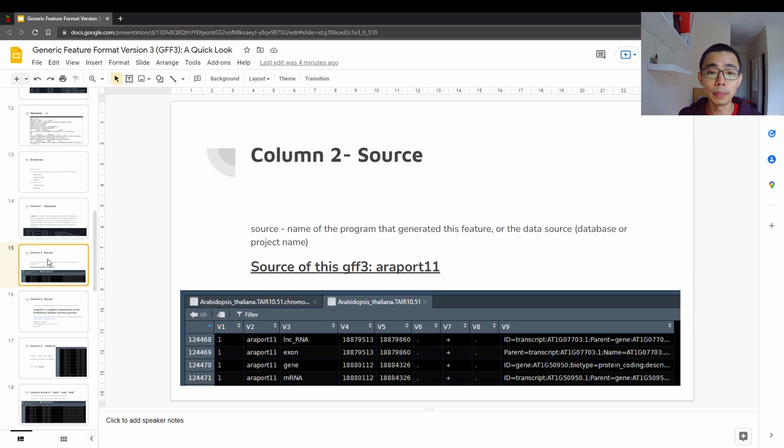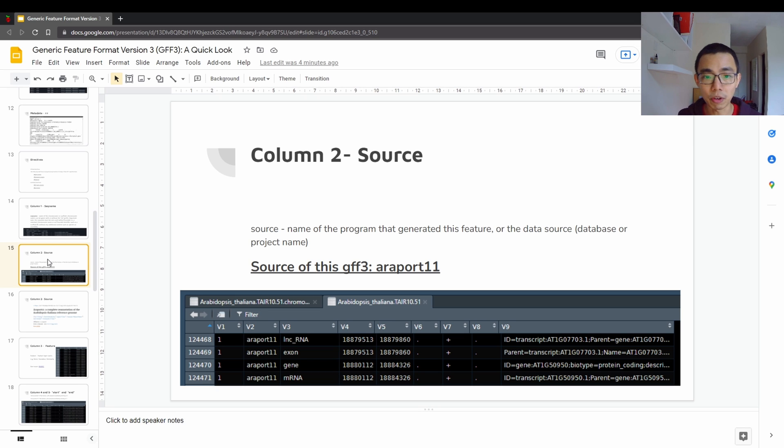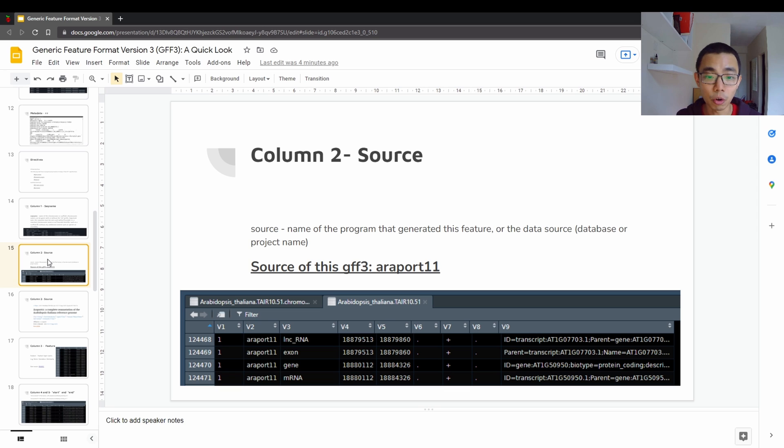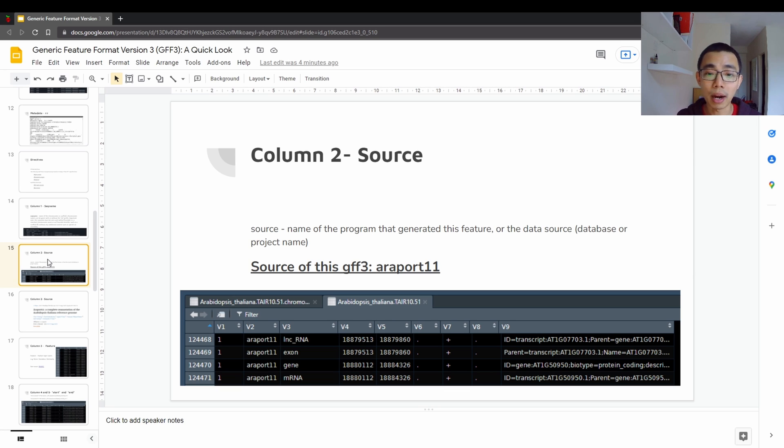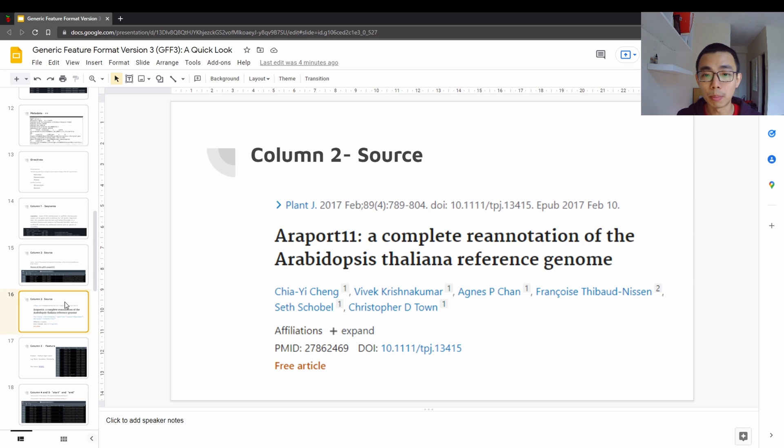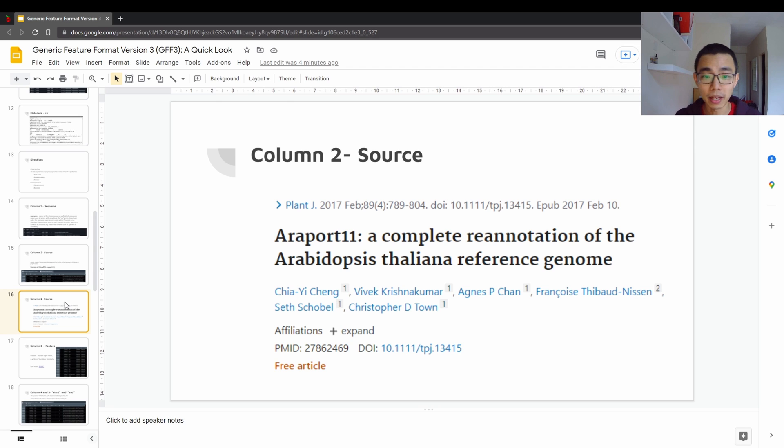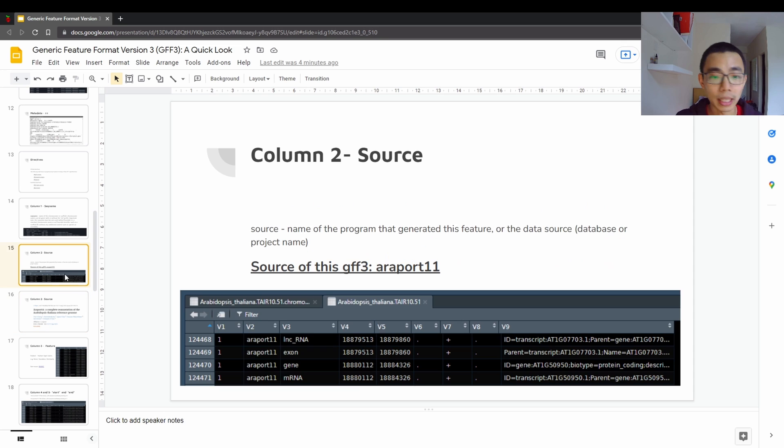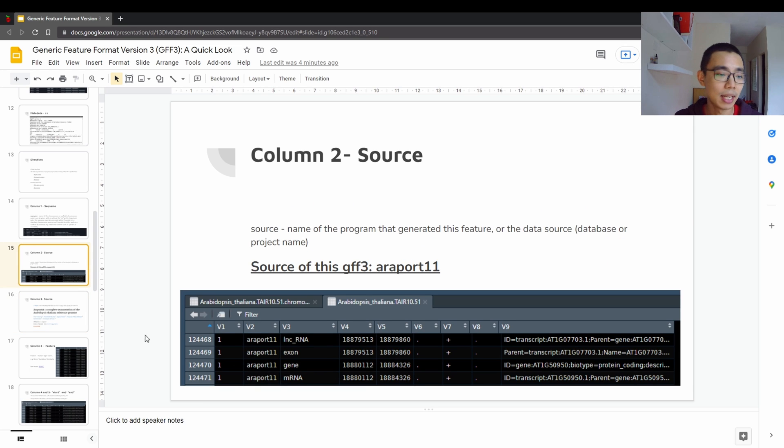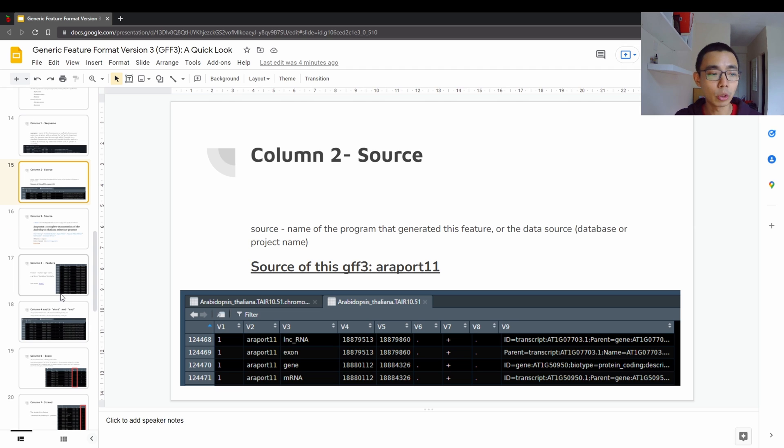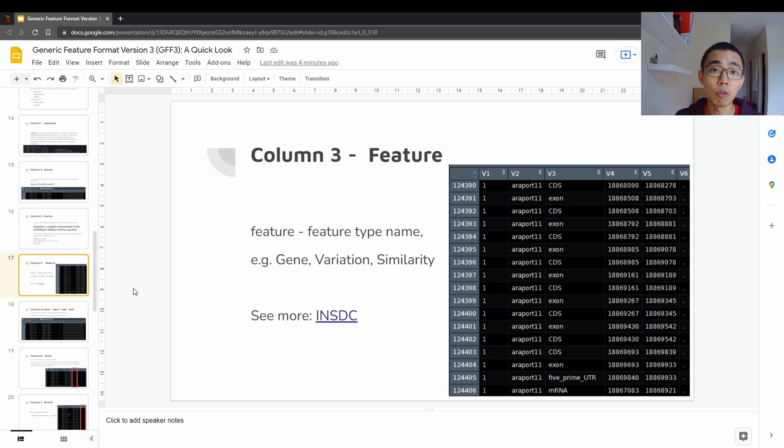So the second will be the source, which is where this sequence is coming from, where this annotation is coming from. So in this case, the annotation for the Arabidopsis thaliana that I downloaded comes from a project called Araport 11, which is actually a project to do a complete re-annotation of the Arabidopsis thaliana reference genome. It's published in 2017, and it's actually quite new. So you can see that it's on the second column. We can see Araport 11, and different species, different projects, have of course different names for their sequence number.